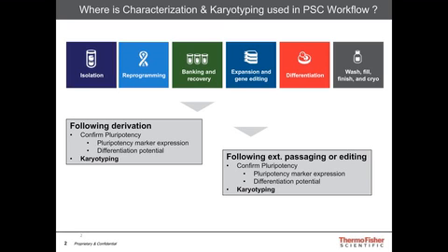Shown here is the schematic of stem cell workflow. iPSCs are generated from somatic cells via reprogramming. Cells are then expanded and either edited or differentiated into multiple cell types. With the advent of new methods and technologies in the past few years, we as a scientific community have made significant progress in regenerative medicine, utilizing stem cells as a tool for the treatment of many complex diseases. As stem cells move from bench to bedside, there is an imperative need for extensive characterization methods.